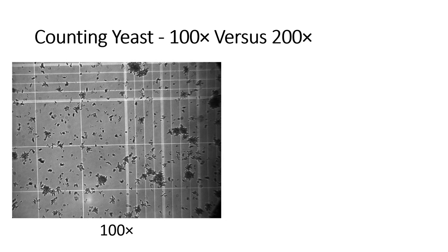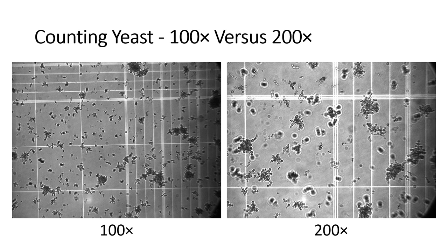To show a quick example of counting: here on the left we're looking at 100x total magnification. These are yeast on a counting grid called a hemocytometer. While some cells can obviously be easily seen and counted, other cells — particularly in clusters — are fairly difficult to tell apart. This is why 100x isn't really quite enough for counting cells. If we zoom in to 200x, using a 20x objective and a 10x ocular, we now have enough magnification to see individual cells even when they're in certain clusters. At 200x or 400x, you can count the yeast in a cluster. That's really all you need if counting is what you want to do.